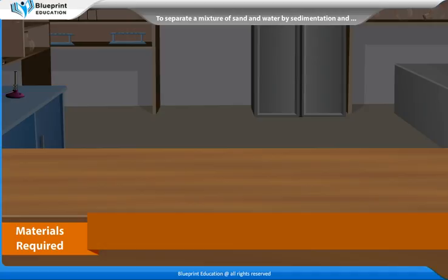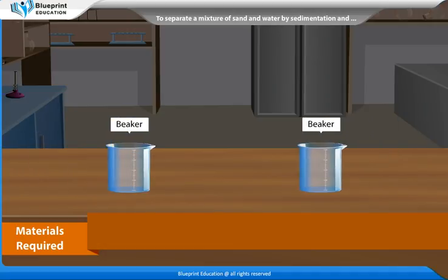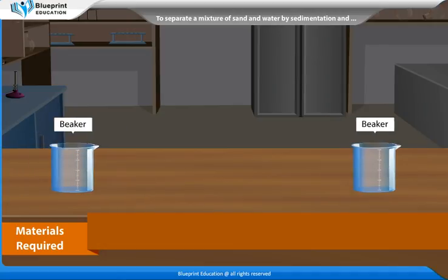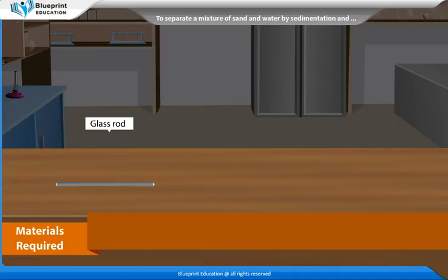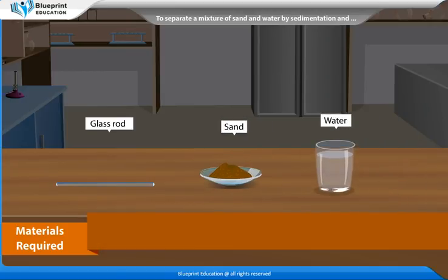The materials required are 2 beakers, a glass rod, sand and water.